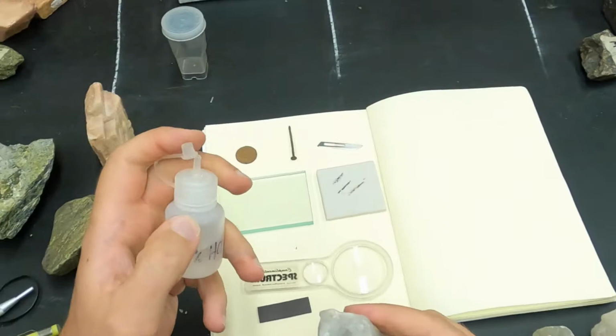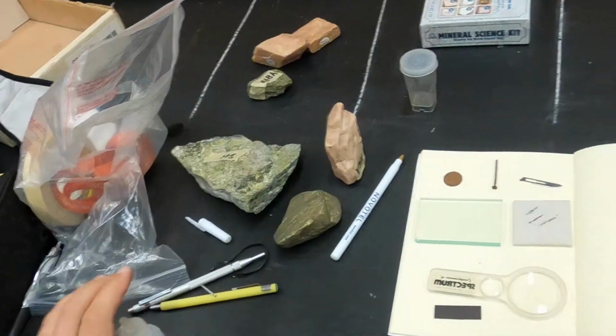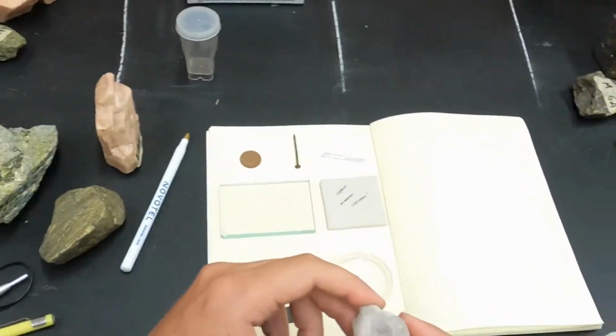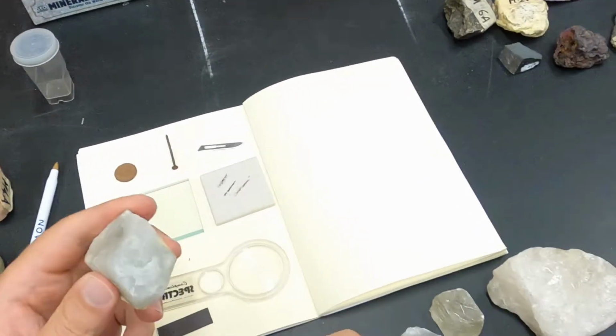There is calcium in here, but it's a fluoride compound, so calcium fluoride will not really react. You need the CO2 of your carbonates to react and produce effervescence.